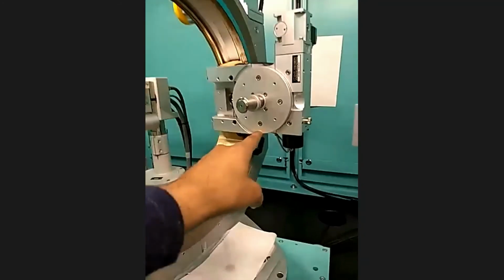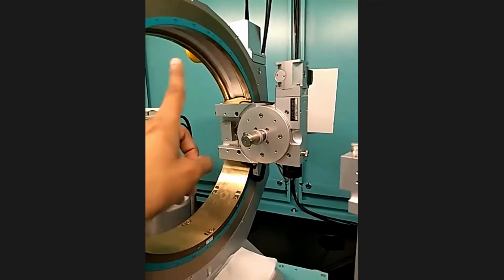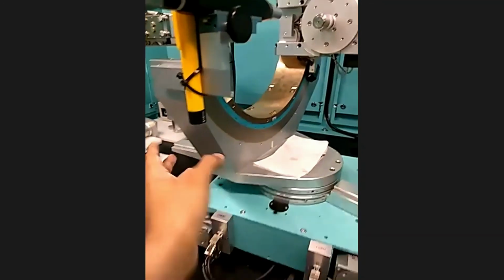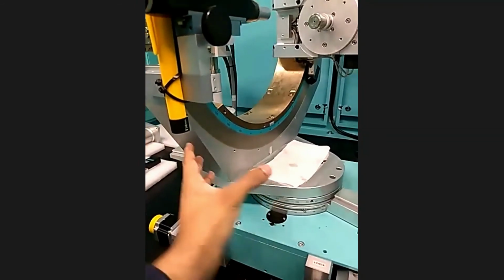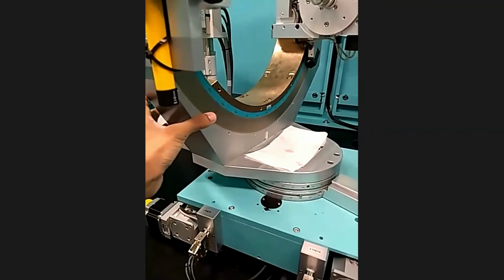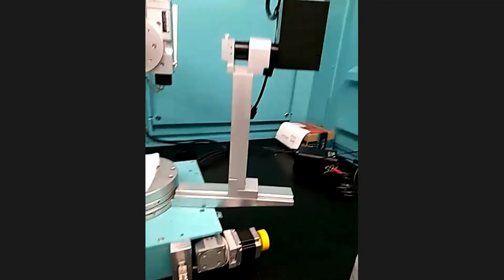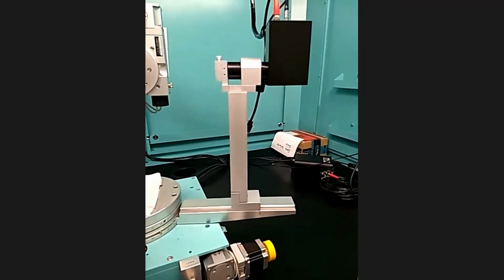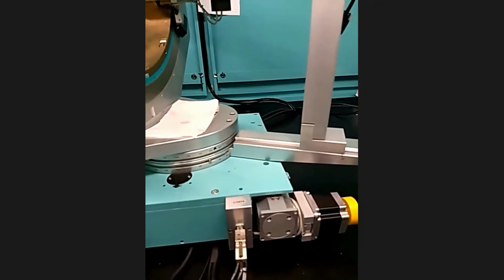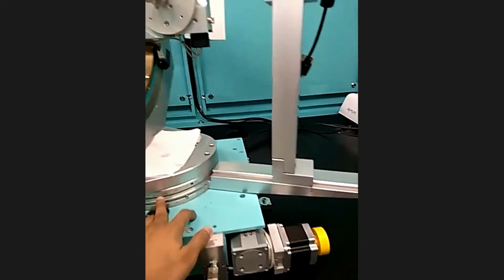And this can rotate like this along the arc. This is the chi motion. And moving this is the theta motion or omega motion from the slides. This is a separate arm, which is the detector. Like you can see, this is a different arm altogether. It can move independently.